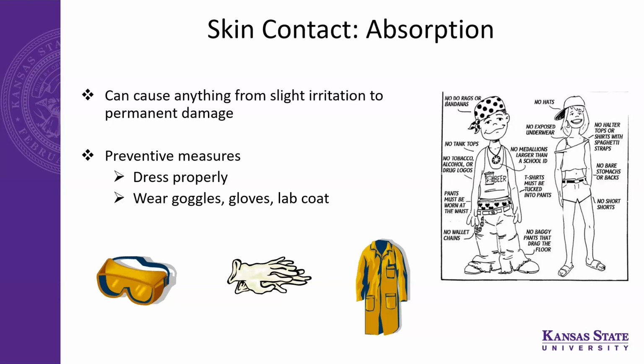So if I talk to them in a kind way and explain the consequences, then they understand. The first thing I hear, of course, is that it is not convenient to have the safety glasses on all the time, especially if you're wearing glasses like me, it fogs up sometimes, depending on the weather conditions. Whenever I go to a lab, I see at least one or two kids not wearing the safety glasses. So the first thing I do is point at them and tell them to wear the glasses. Then I explain that, of course, it is not convenient, but what if something happens? What if something goes into your eyes? As long as things go smoothly, no one will complain. But if there's an accident, we have come across incidents, right?